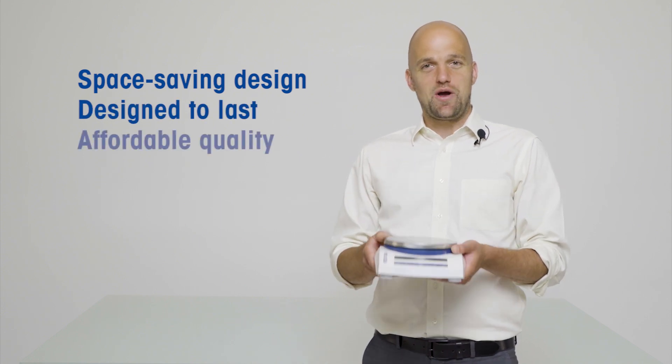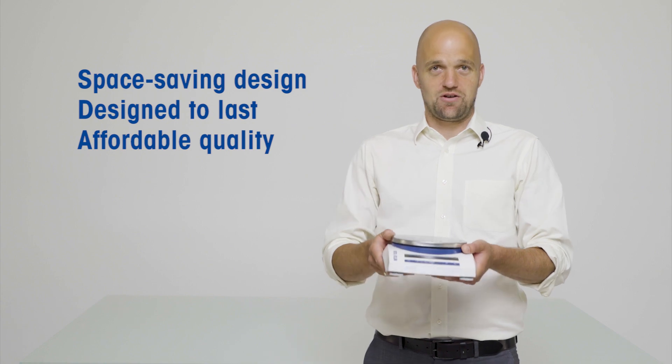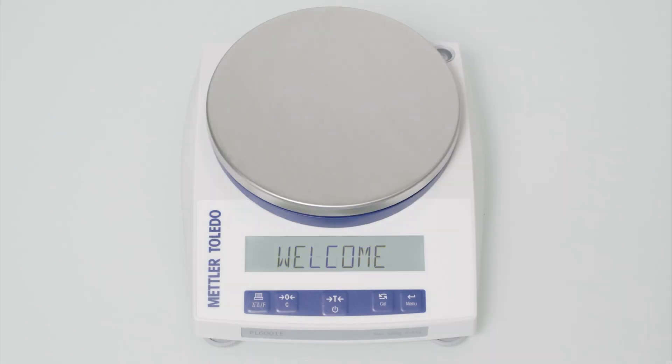Proudly introducing the PLE, weighing when and wherever you want. Let's have a closer look. The PLE line are portable balances available with capacities up to 6.2 kg and readabilities down to 0.01 grams.